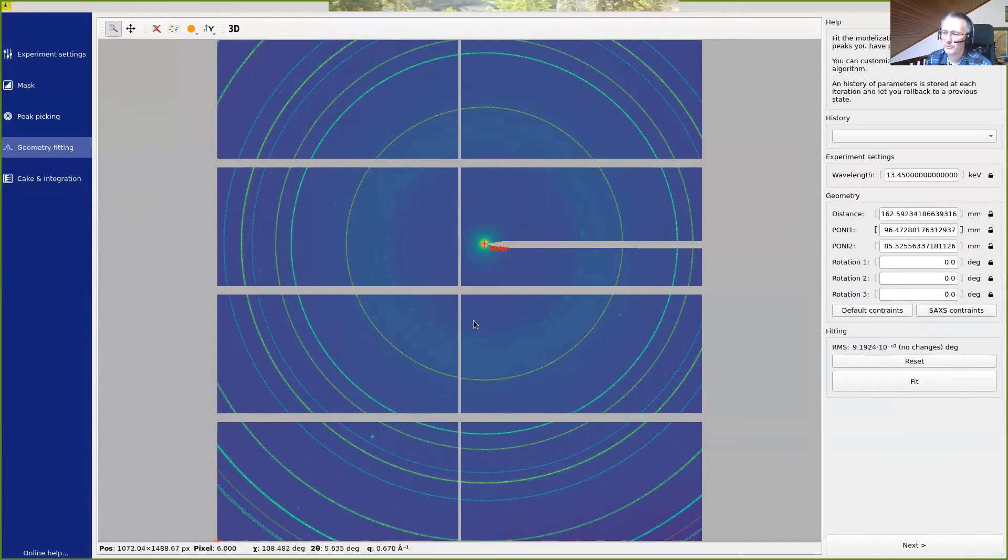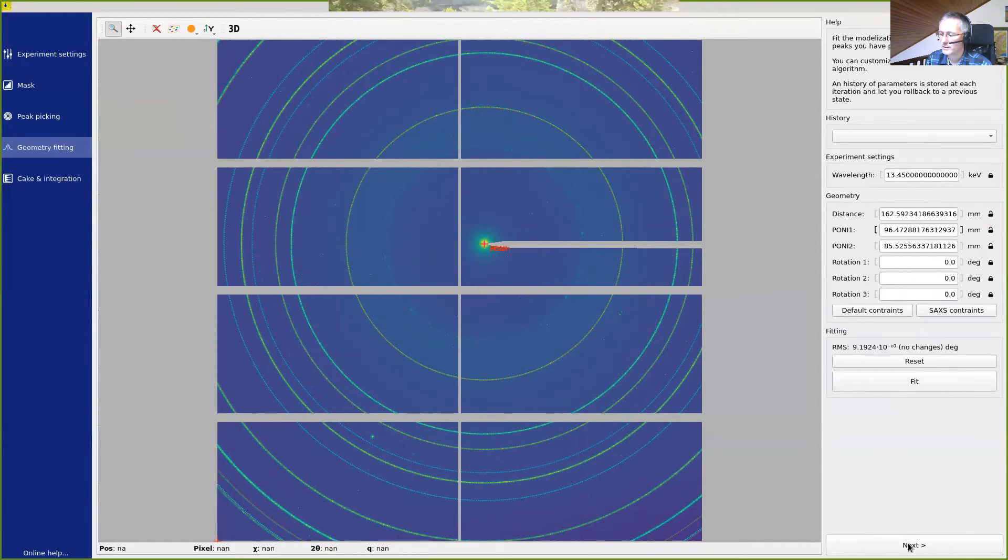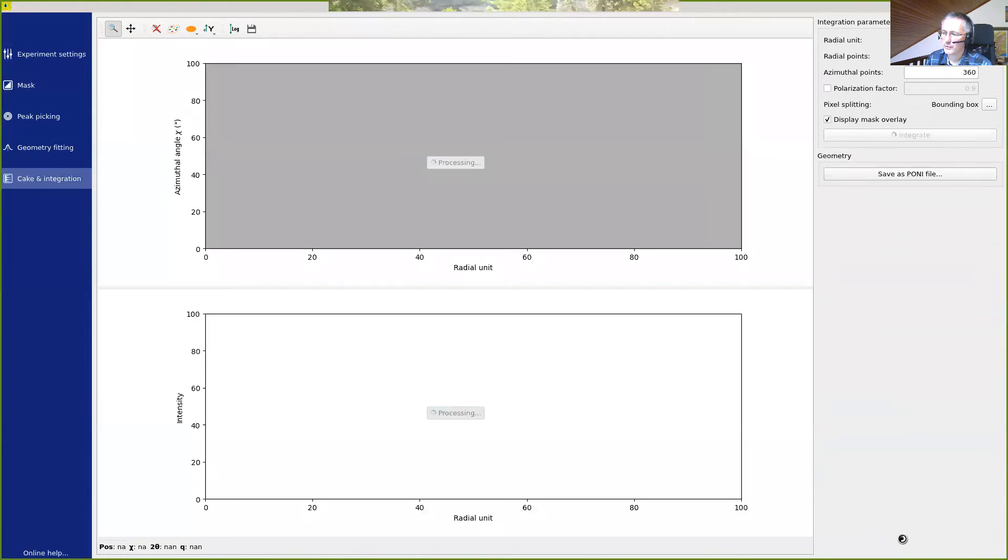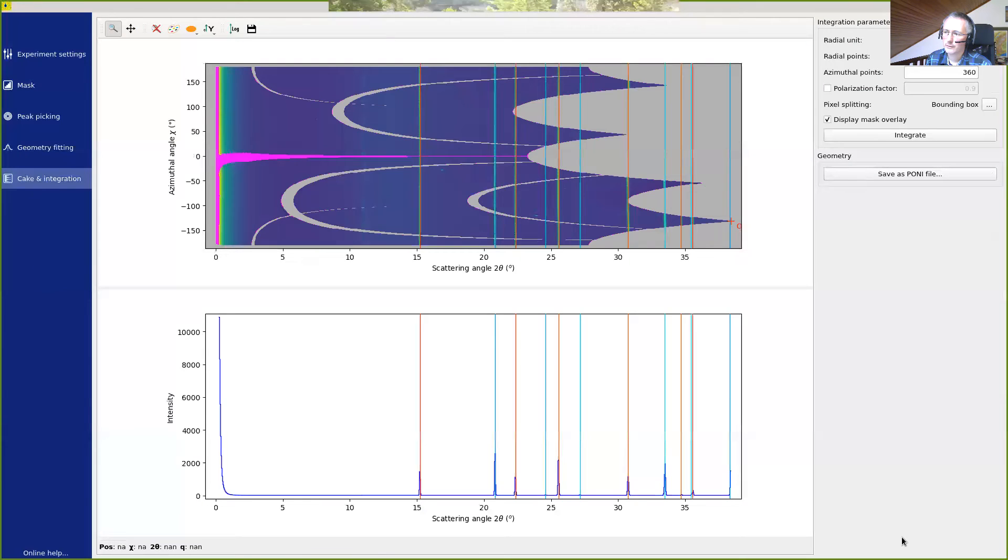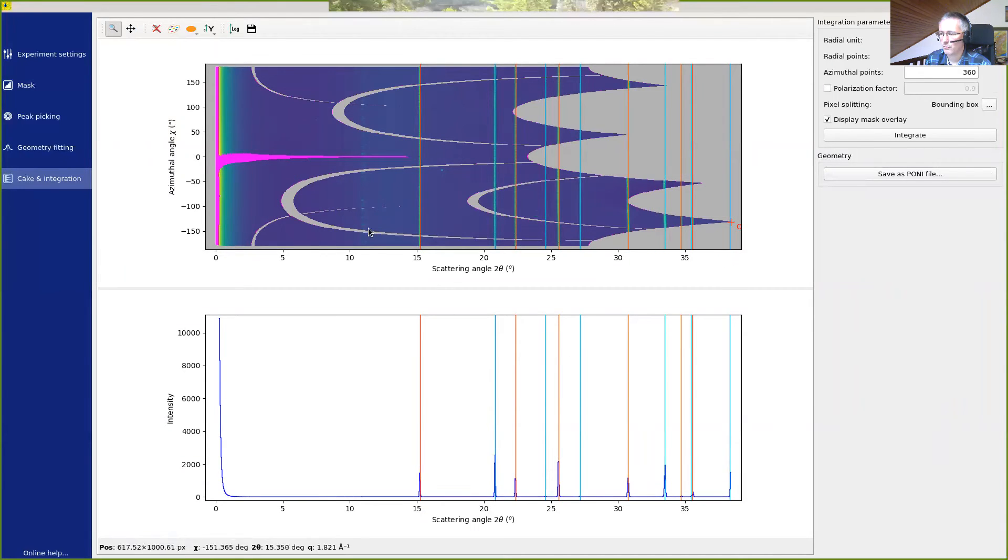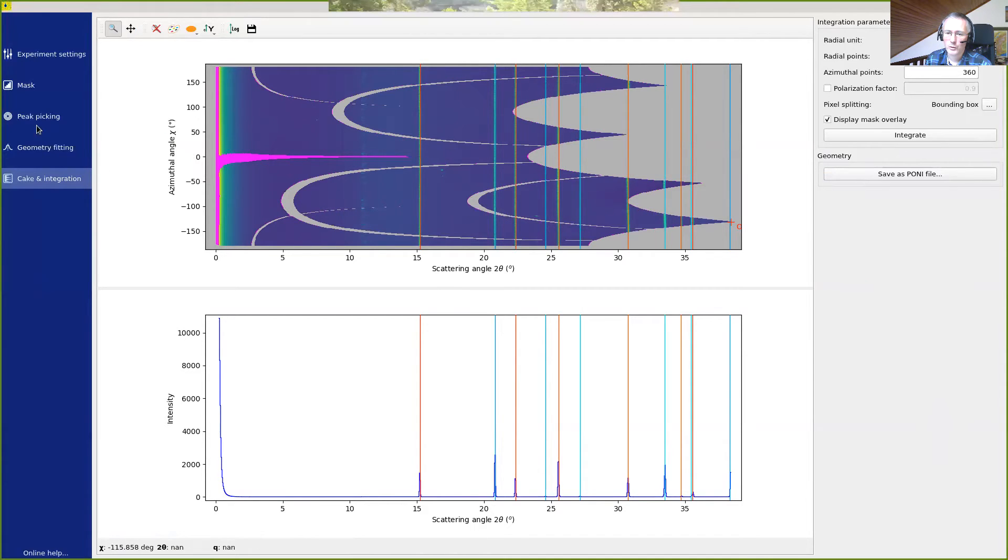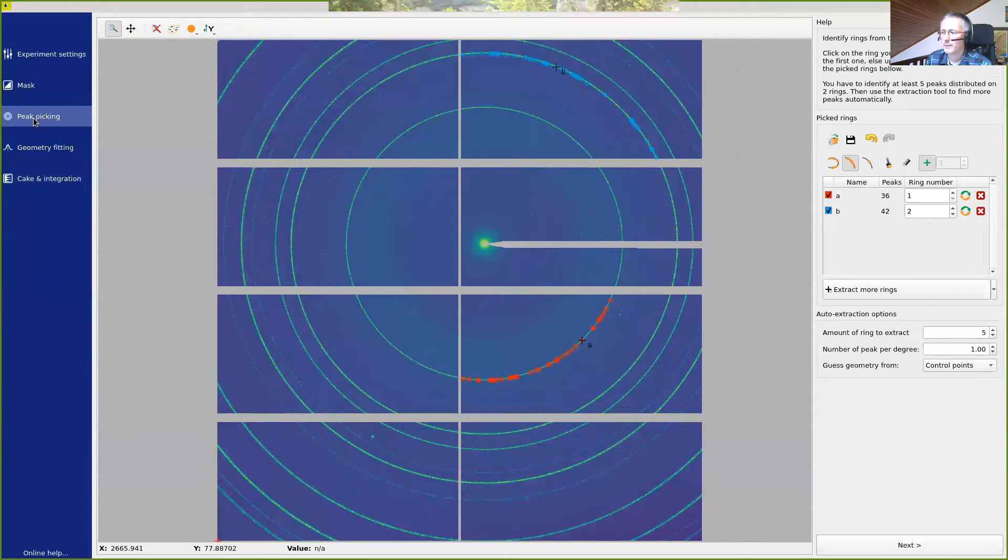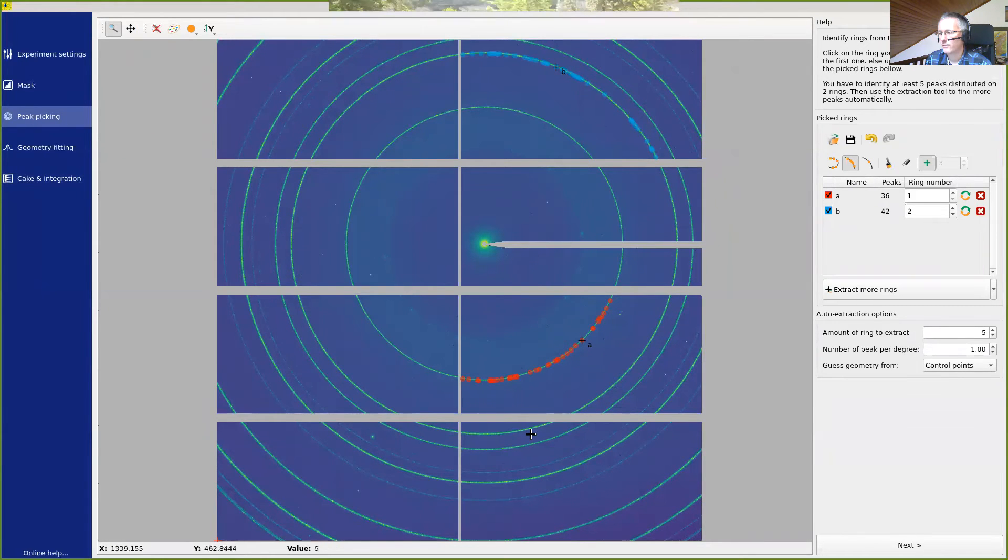At this stage, we have performed the calibration using only two clicks. And if we go to the cake, we can see that it already looks not that bad.